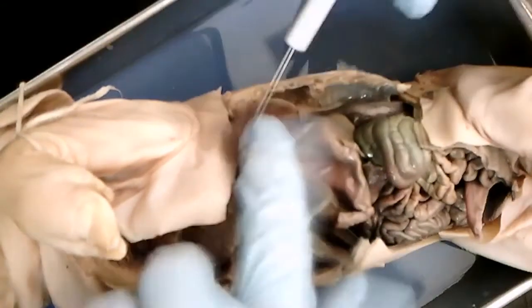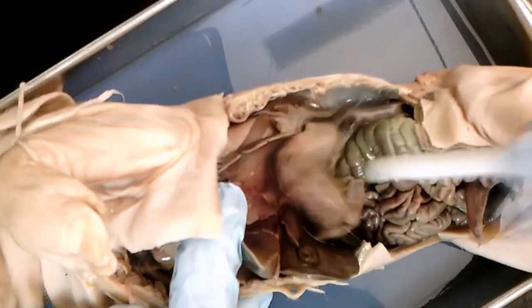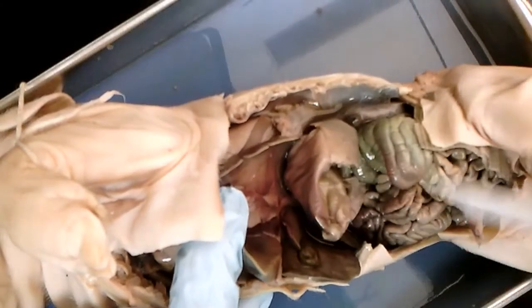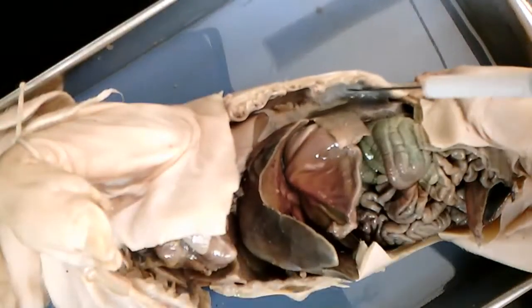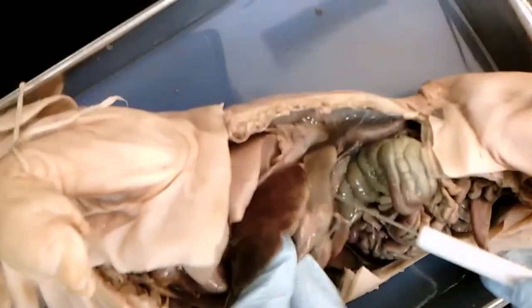So then, can anyone tell what this organ is underneath the liver? Right underneath the liver. I know. Matt? Is it the stomach? Yes, you're correct. It is the stomach. And now I actually cut through just a little piece of the spleen. The spleen is a long, firm, feather-shaped organ, and it's just to the left side of the stomach. So I'm going to try to show it to you. It has a nice little tip like a feather, but mine does not because I cut it off.